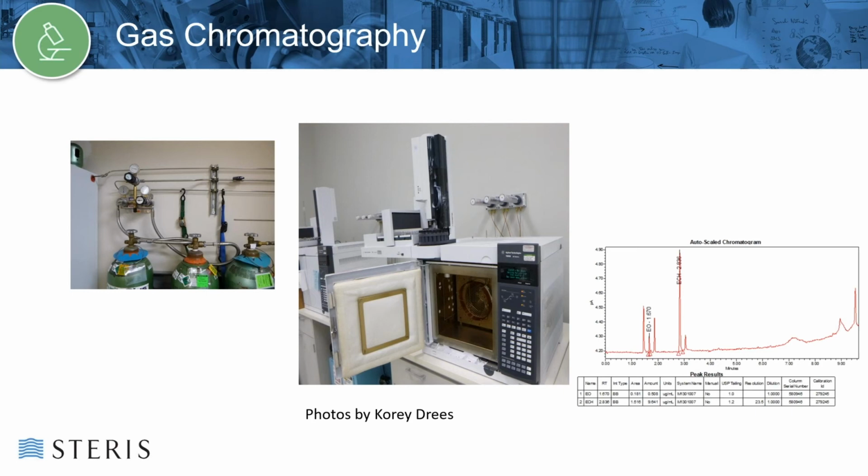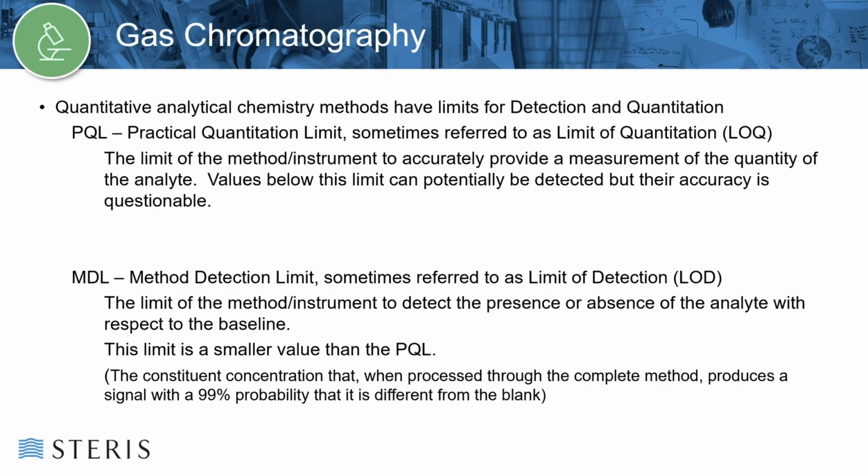When the chemical reaches the detector, it is translated to a detector signal that shows as a peak on a data processing unit. The time it takes for the analyte to go from injection to detector is known as the retention time. NIST traceable reference standards of the chemicals of interest are analyzed at several dilutions. The standard curve is used to correlate the detector response, or area under the peak of the chromatogram, at the retention time of our analyte to give us the amount of the analyte in our unknown sample.